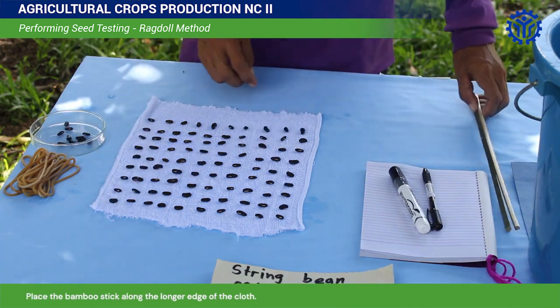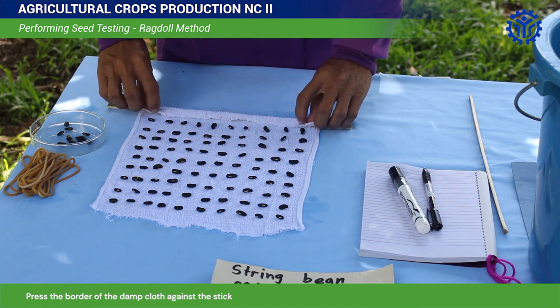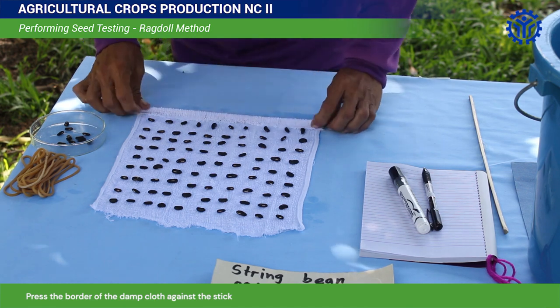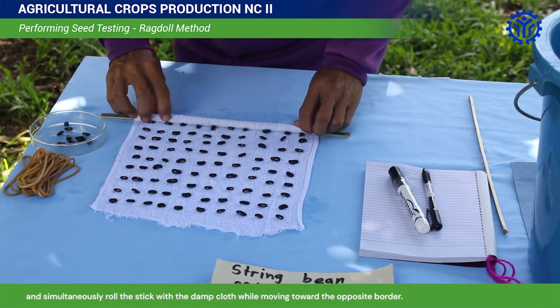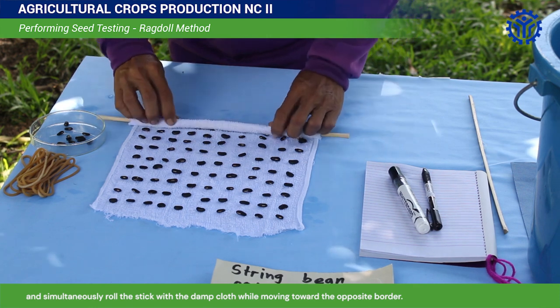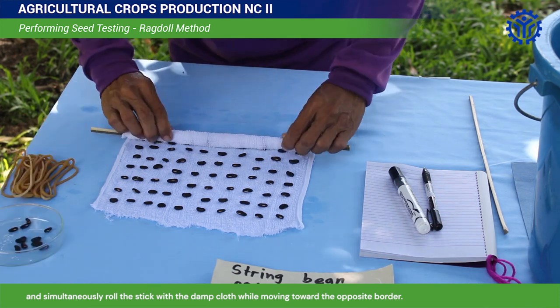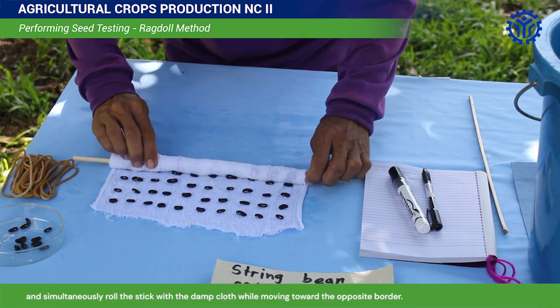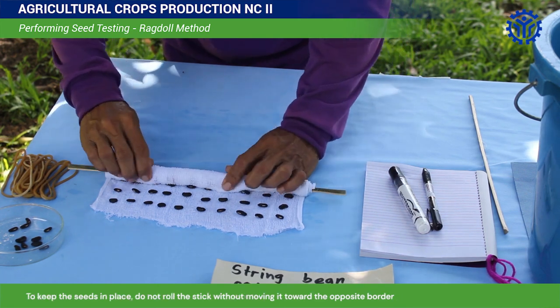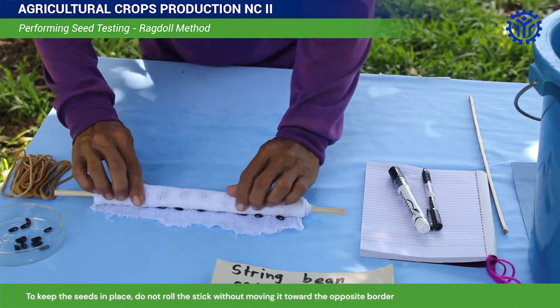Place the bamboo stick along the longer edge of the cloth. Press the border of the damp cloth against the stick and simultaneously roll the stick with the damp cloth while moving toward the opposite border. To keep the seeds in place, do not roll the stick without moving it toward the opposite border.